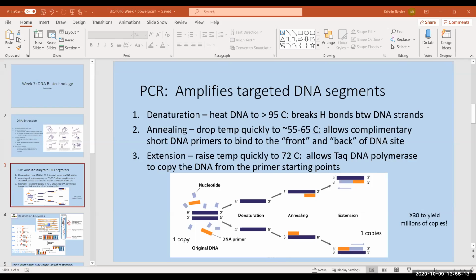What you're going to do is open up part 1, and you can read a little bit about the key concepts. This is very much like what we just talked about. You can always go back and see this introductory material as you're doing the lab, and it discusses how this experiment works. So what you're going to do is what we just described. You're going to be using strawberry extract, and you're going to get some of that out. You're going to mix it with some salt water, and here's the proteases.